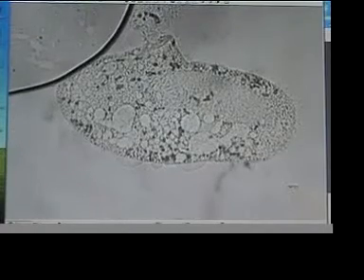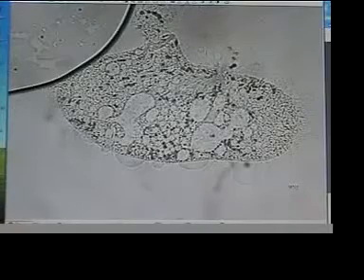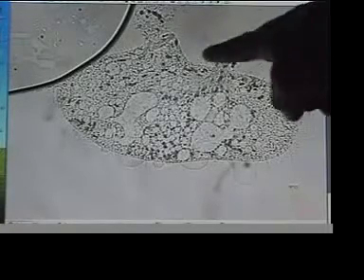He is undergoing this. It was a sudden, dramatic change. He had stopped swimming. Here we see an explosion right here. And of course, he's exploding out the top as well. So we have several openings, and you can see some blisters forming along the bottom. Note the formation of the spheroids here. We've seen this before with Blepharisma. As the internal material is ejected, it's forming into spheres, which is very interesting.